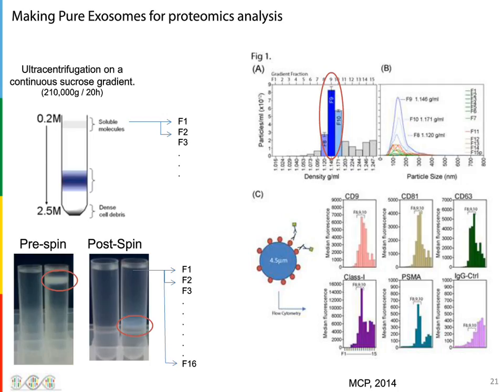In figure 1A, we analyzed each fraction collected from the gradients for the presence of nanoparticles using the NanoSight platform. We see very clearly a peak in fractions 8, 9, and 10, where we had the greatest number of nanoparticles. These were small things that were generally less than 200 nanometers in diameter. The mode of the peak was around 130.